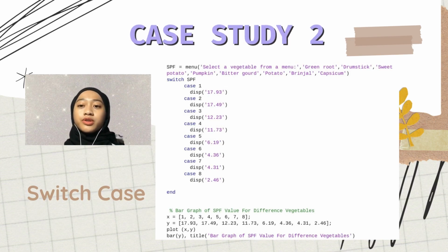In the same Mansur equation, we also build the switch case and bar graph. For the switch case, we already put the SPF values for each vegetable. The purpose of this switch case is to make it easy for us to see the final value of SPF by clicking one of the options.